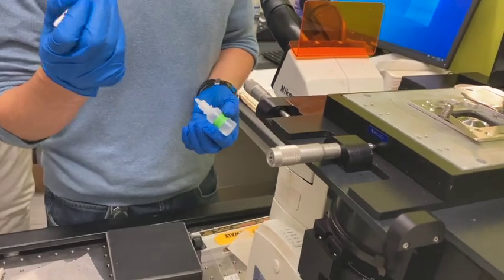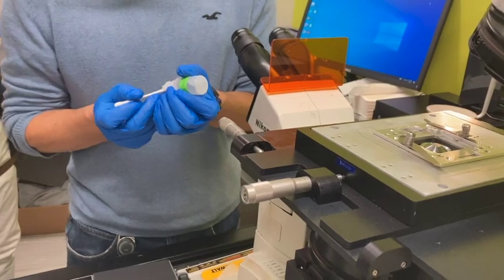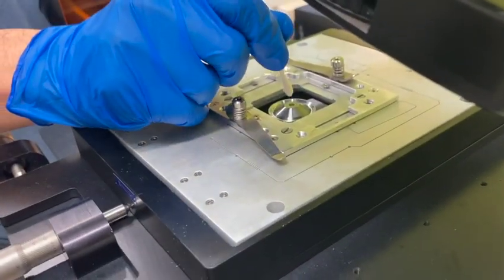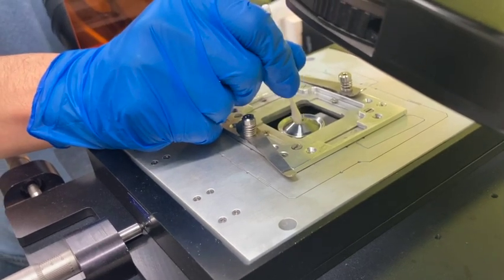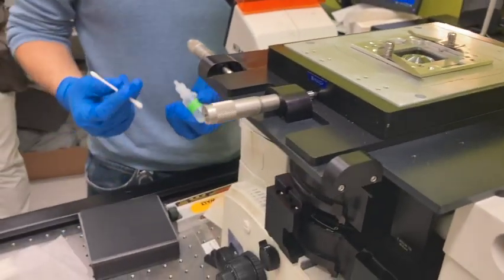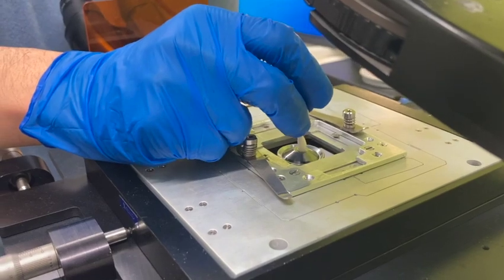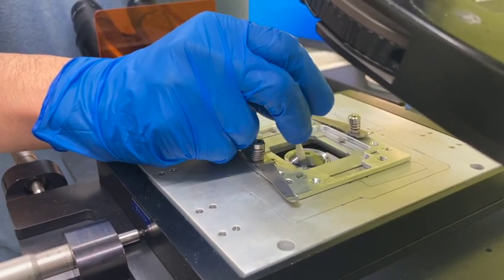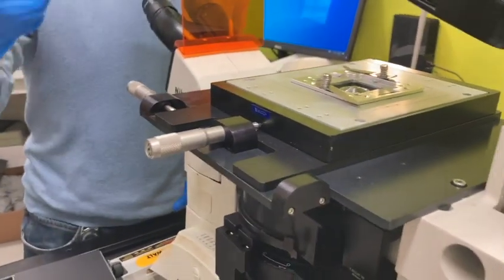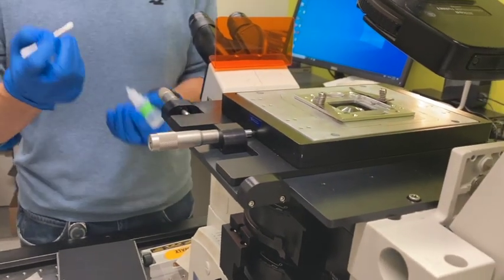Okay. So the normal way I do it is with this Q-tip. Just put a drop. We don't need to use much because there will be residue. So I rotate from the center. Textbook, yeah, also just rotate from the center. You are not going to do it this way because it's just going to mess up. You start cleaning from the center and then repeat it twice.